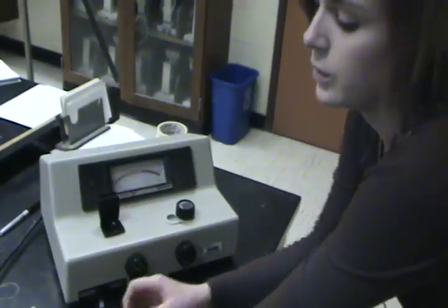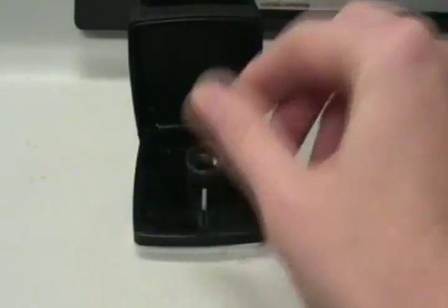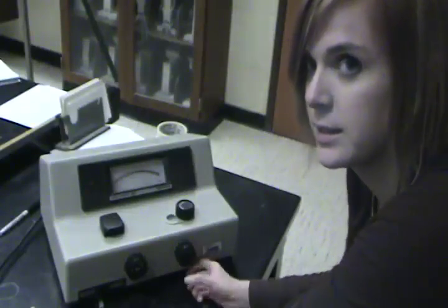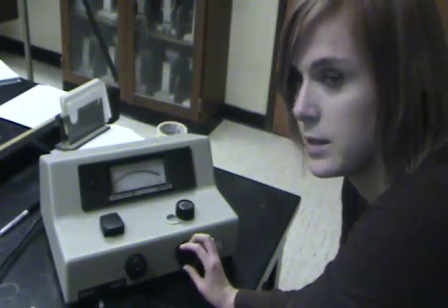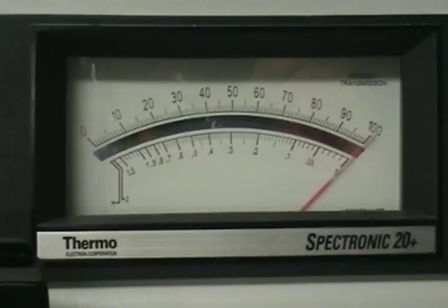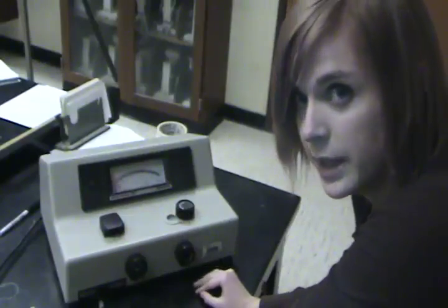The next thing that we need to do is blank our machine. Now that our blank is inside, we can turn the right transmittance knob all the way until it reaches 100%. We have now successfully blanked our machine.